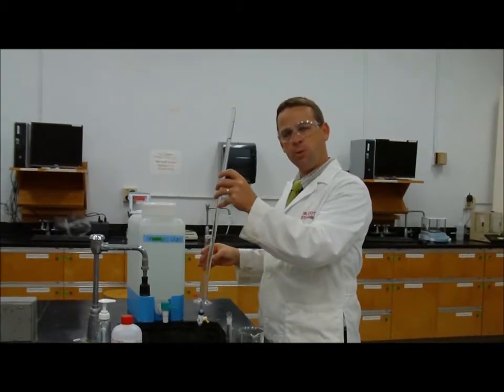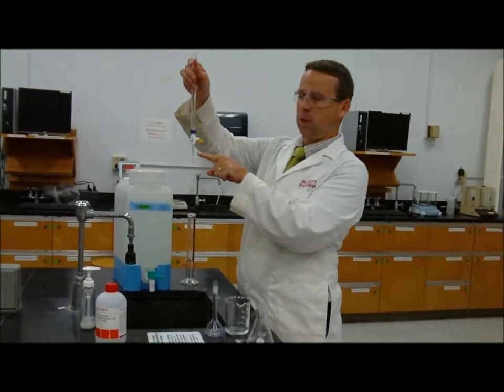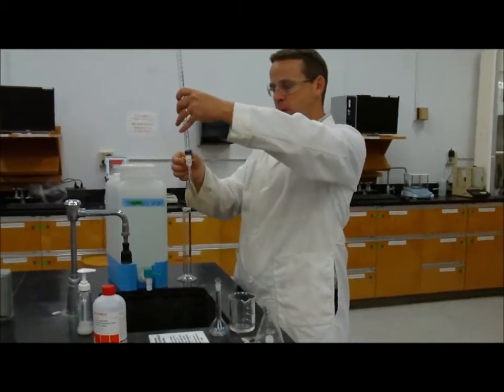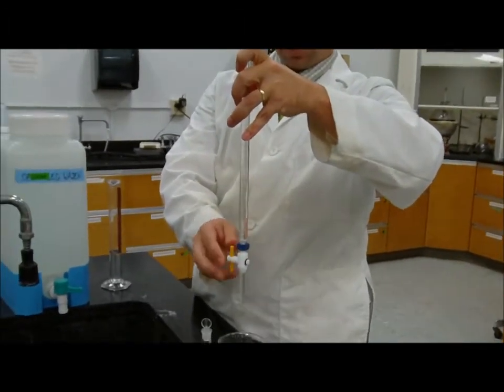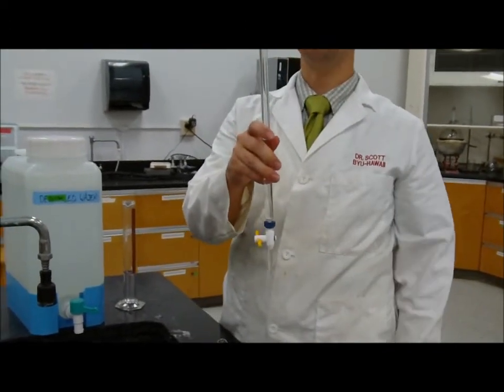So after about 3 or 4 rinses, I'm ready to go. I fill this up. But now I have to look at this tip here and make sure that there's no air bubbles. Also, this here is water, so I want to make sure that I remove any excess water there and extra air bubbles into the waste. So I turn it on and make sure any air bubbles have come out. And that is long enough to rinse out any water that was there as well.